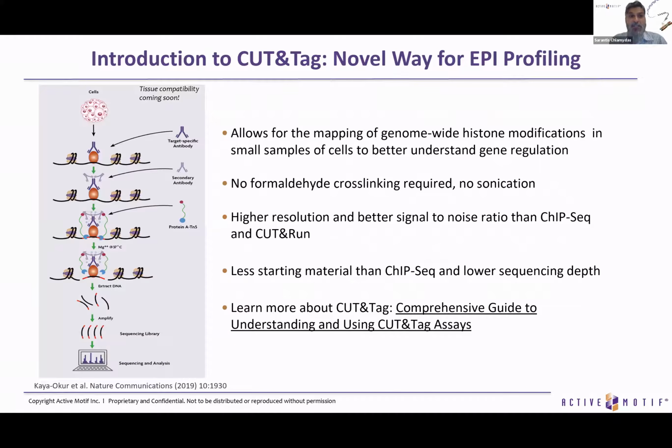Changing gears a little bit, now we have the new entry. I will present the protocol of CUT&Tag, initially originated in the laboratory of Henikoff. As I explained before, you don't need to fix the cells. You just immobilize cells and nuclei on concanavalin A beads.